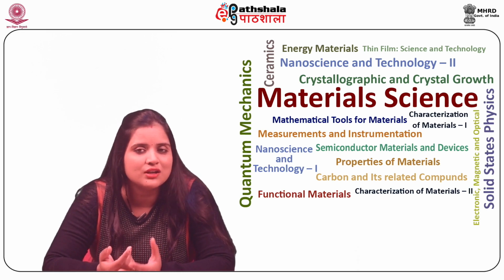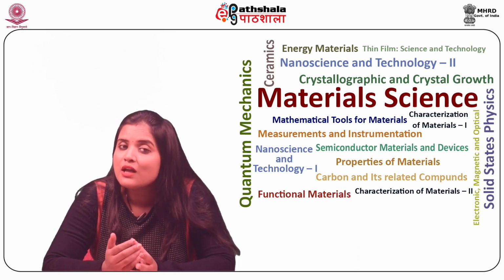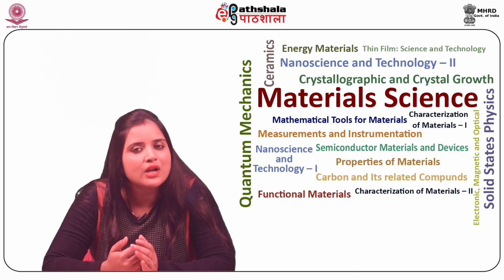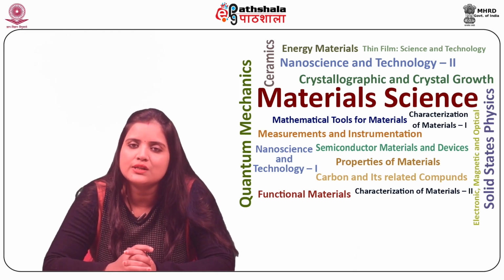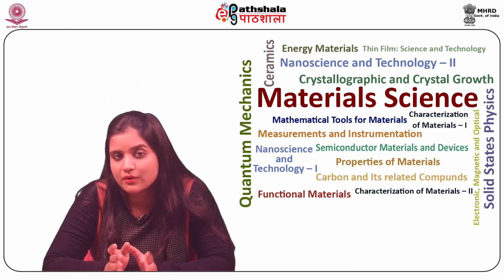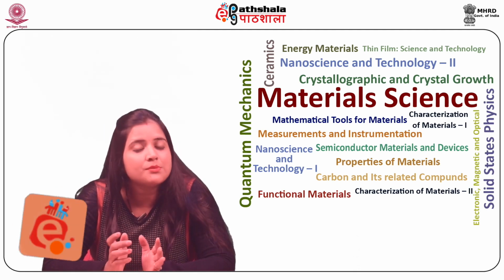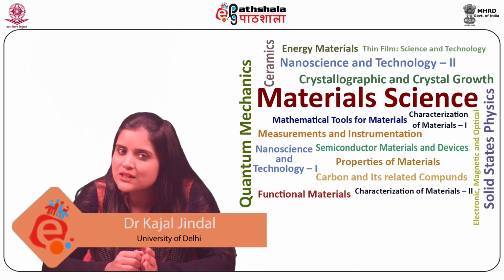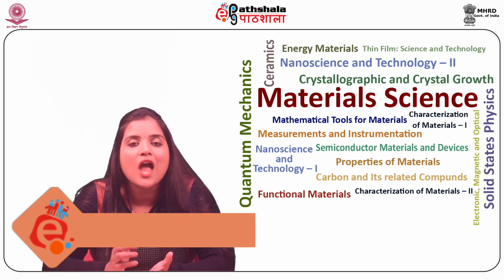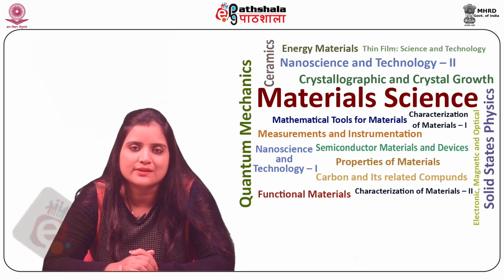The electron tunneling through a potential barrier in STM was described in detail along with the advantages and disadvantages of STM. Then, the principle of operation and modes of AFM were studied and its advantages and disadvantages were discussed.